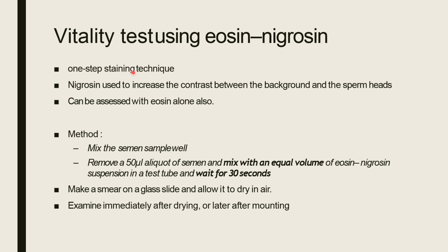So as we said, it is one-step staining technique. Nigrosin is used to increase the contrast of the background, and the eosin could be used alone.